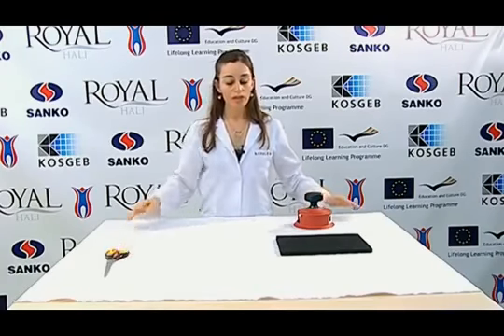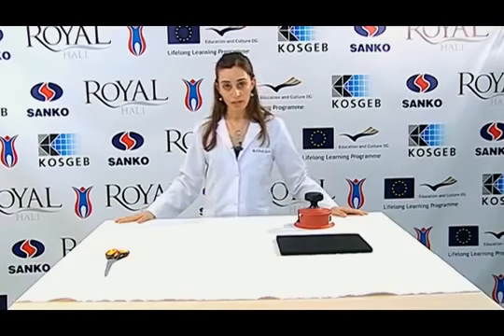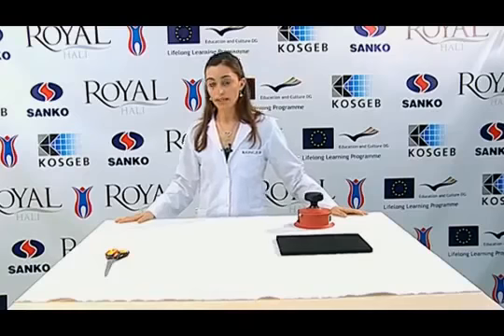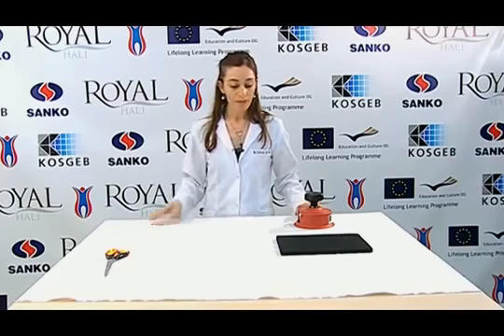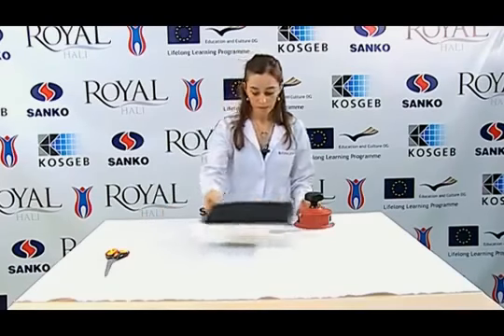Primarily, the sample is laid on a flat surface. When taking the samples, attention should be paid not to take the samples from parts close to the edges. At least a 15 centimeter space should be left from the edges. Moreover, samples should not be taken from places where there are wrinkles and fold traces.